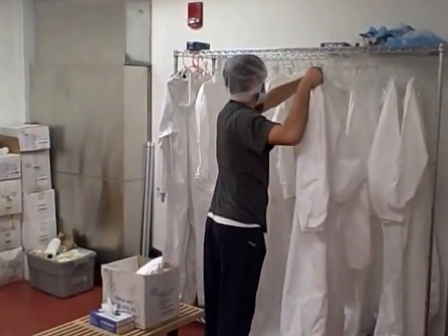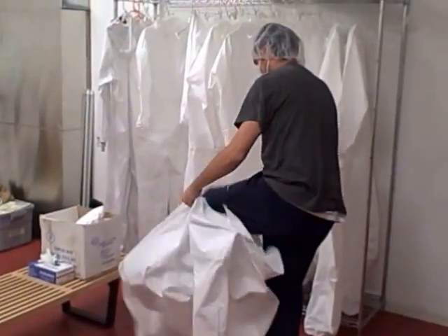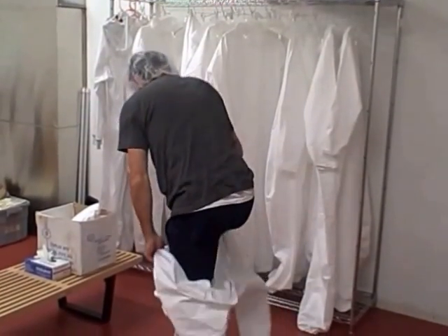Remove your suit from the rack, taking care to prevent the upper part of the suit from touching the ground. Put on the suit like snow pants — feet first, then arms.